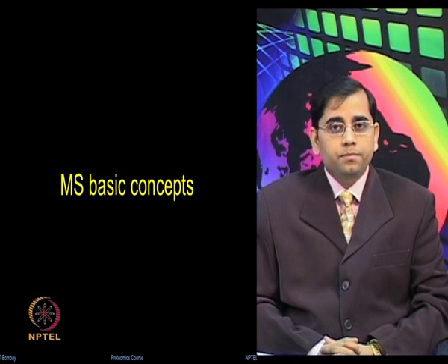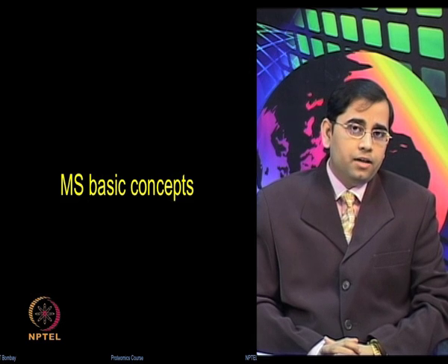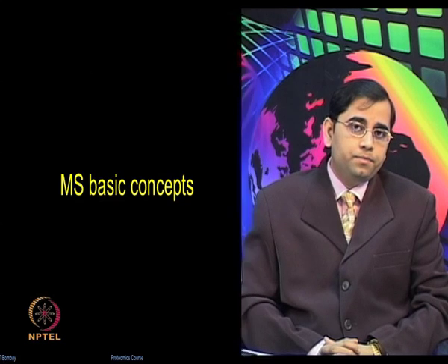MS has become an important analytical tool in biology in general and proteomics during the last decade, and now various applications have emerged by using MS based platforms. It offers high throughput, sensitive and specific analysis for many applications. Let us first look at some of the basic concepts of mass spectrometry.